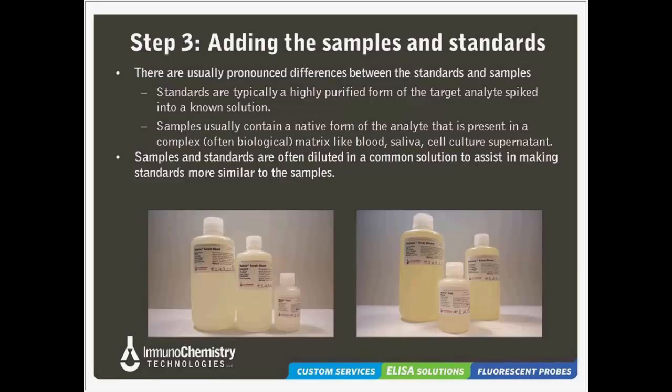Now, this slide we're talking about sample and standards. We offer both a sample diluent and an assay diluent. And if you're not familiar with the vernacular, you might say, well, what's the difference? And I don't blame you. Well, the sample diluent is what it says. It's used to dilute out your sample, your serum, urine sample, plasma, cell culture media. It's used to dilute your sample out to the level at which you can detect it in your assay.